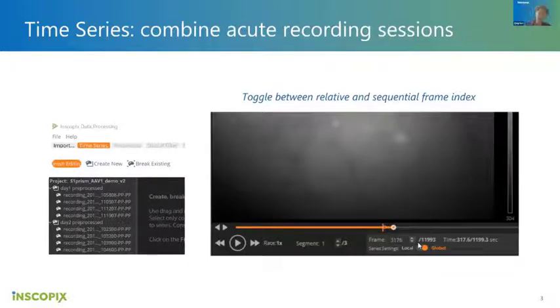Yeah, I think that's a very interesting question. I think Shay mentioned some formats like OME-TIFF, another TIFF format that may preserve some of the metadata about the time series. Maybe in the future, IDPS will be able to do more to keep the time series within the TIFF, just using some other TIFF format. The file formats will be important for legacy systems, which are quite a few out there. Yeah, exactly. The problem with importing TIFFs is that they don't preserve the temporal information, or it's not imported. The metadata is not imported correctly, so that's why the time series gets messed up.